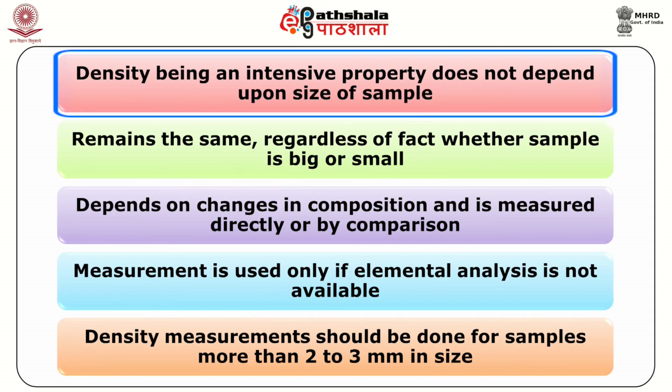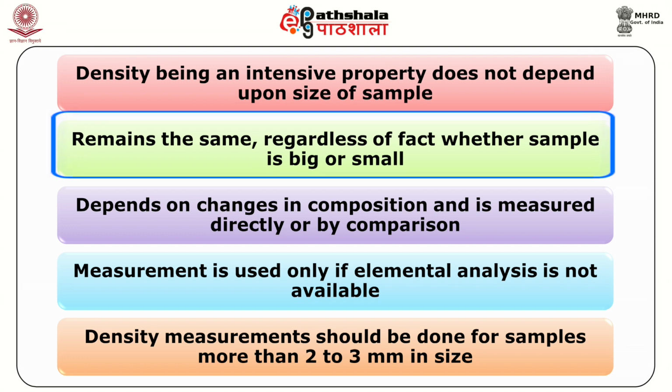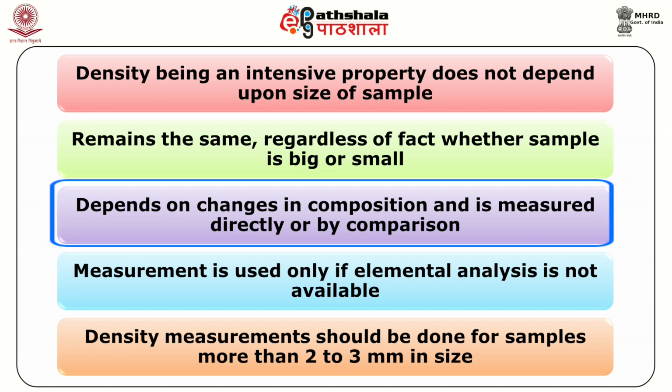Density, being an intensive property, does not depend upon the size of the sample. In other words, it remains the same regardless of whether the sample is big or small. But it depends on the changes in the composition and is measured directly or by comparison.